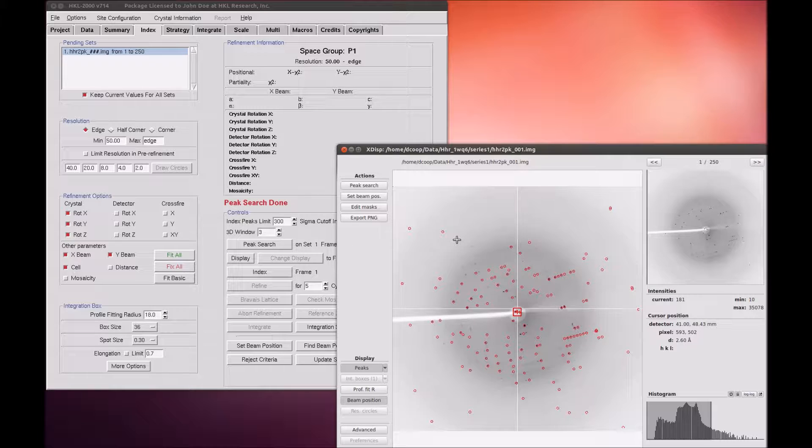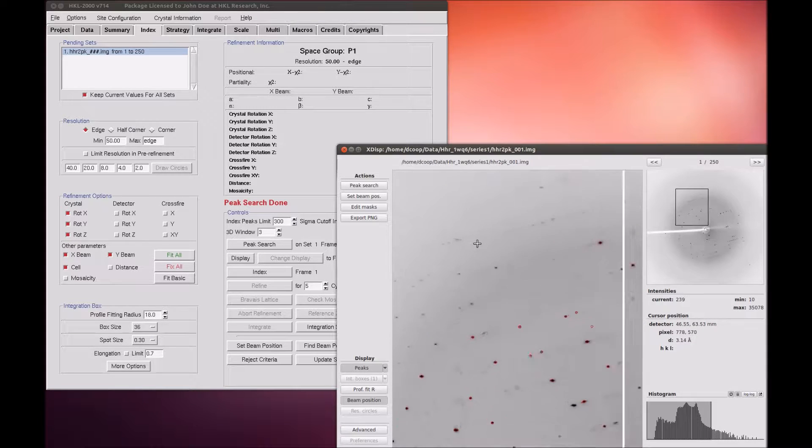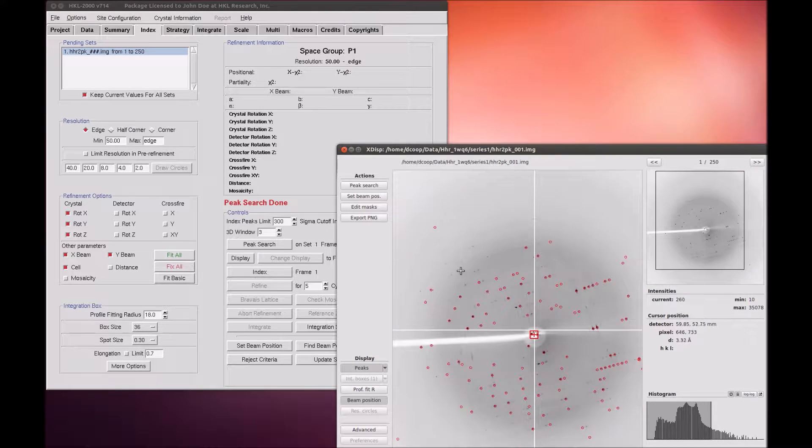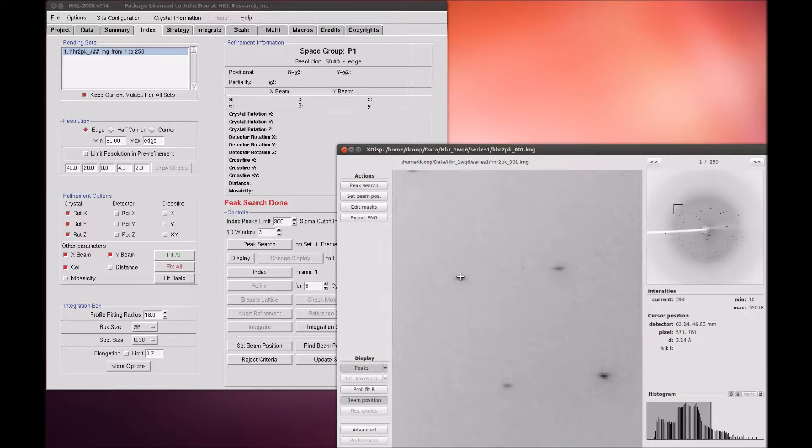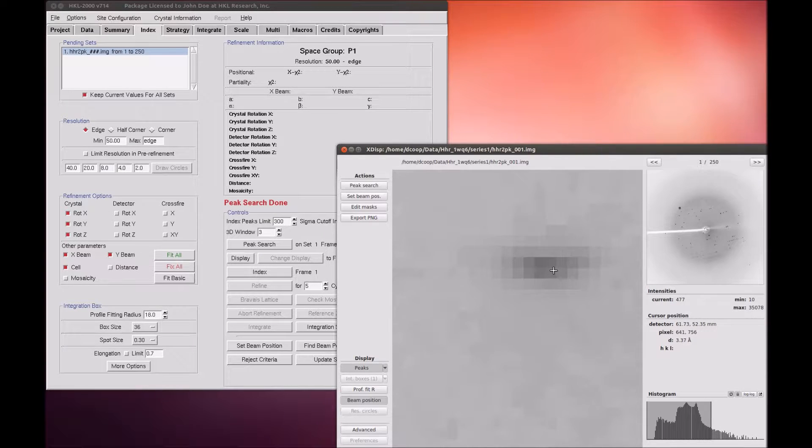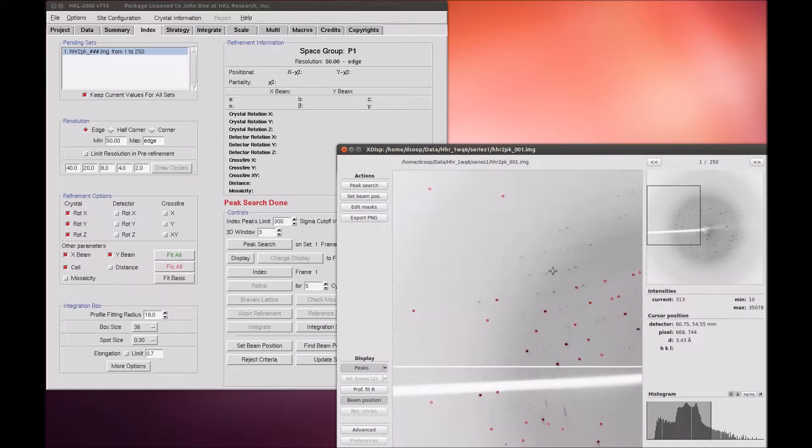The new XDISP has many improvements. Notably, zooming is now controlled by the mouse wheel and will zoom the image using the mouse pointer as the center of the zoom. Push the wheel forward to zoom in.